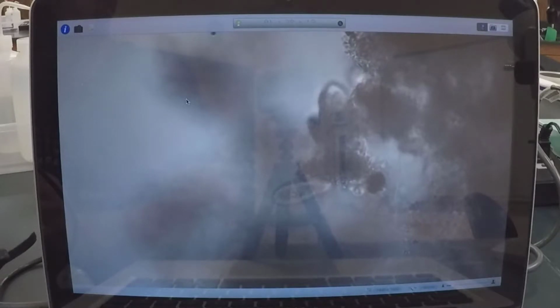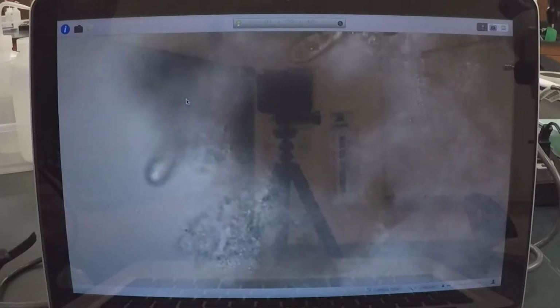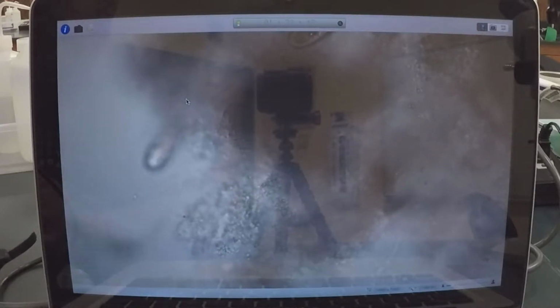And I'm still looking for some diversity. So like there you can see a paranema. Oh man, so I'm kind of chasing it down. They're really large, and you see that flagellum on it. There, it's kind of moving around, and see that flagellum.